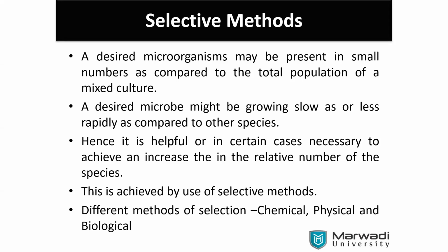Yes, this is called the lawn growth. My God. This one is fully a lawn growth.